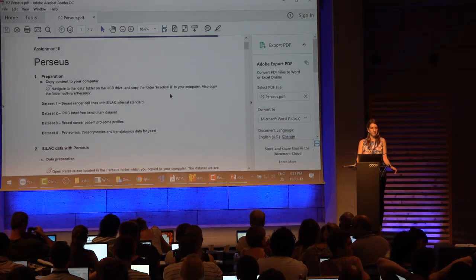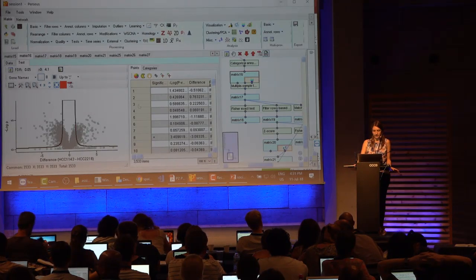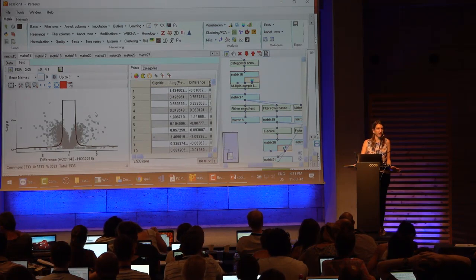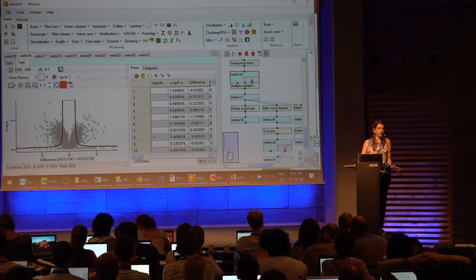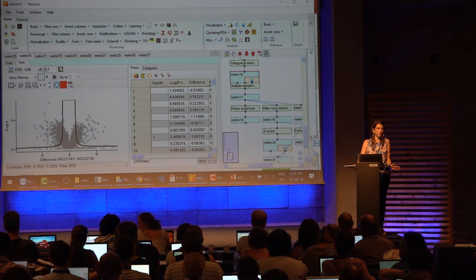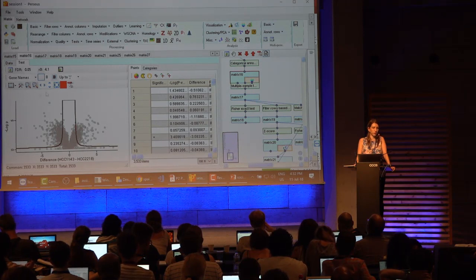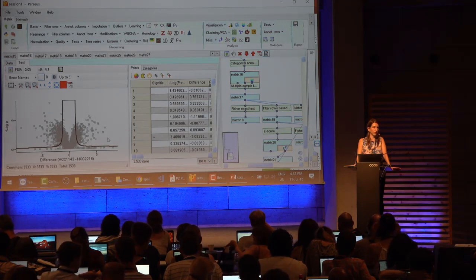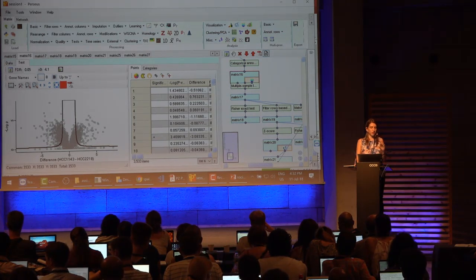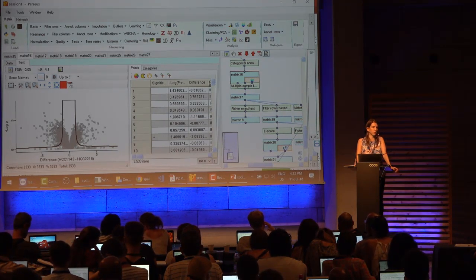Simple. What is the rule of thumb for S0? How big should I choose? We actually advise no rule of thumb, but rather to look at the data and then decide what makes sense for you. There is a way to actually calculate a fixed S0, but at the end of the day, it's up to the users to decide what is really the best one visually, by playing and then checking what is the final outcome of the test. And you should always remember that it's a trade-off between the fold change and the significance value, and then you need to know what you're comfortable with.